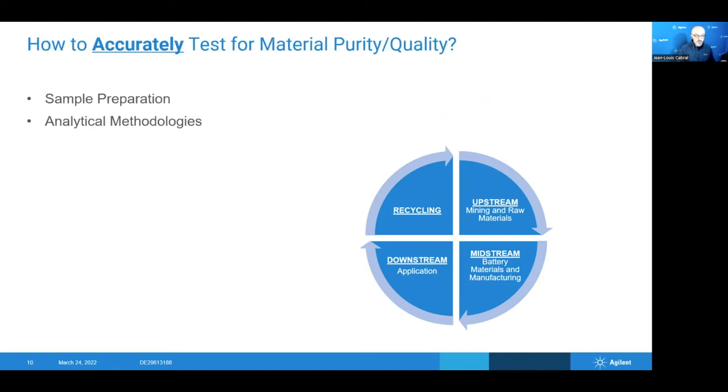Then what we're going to be really focusing on today is how do you accurately test for material purity and quality throughout that complete life cycle. So today, there are two main points we'll be focusing on with my colleagues: the sample preparation and analytical methodologies and considerations.